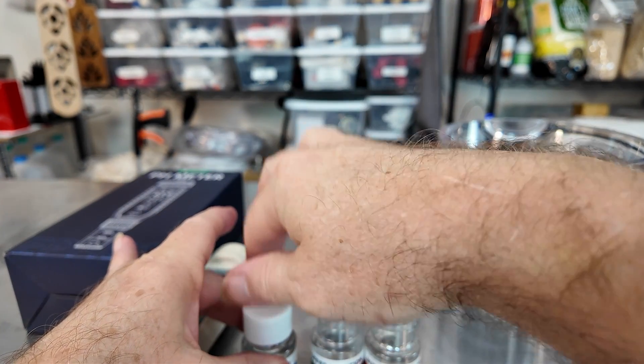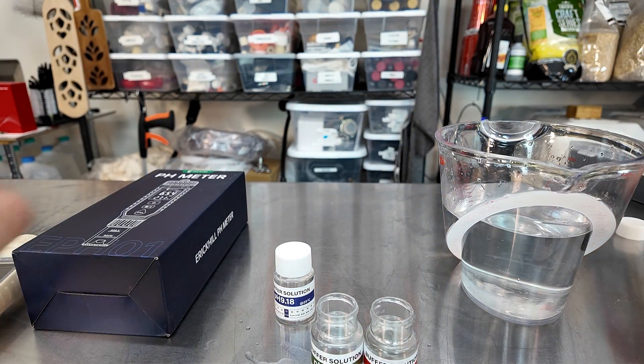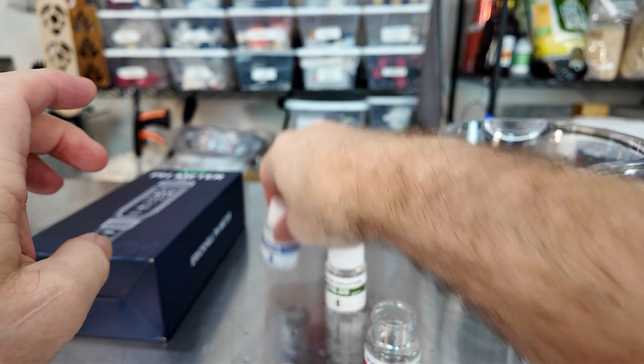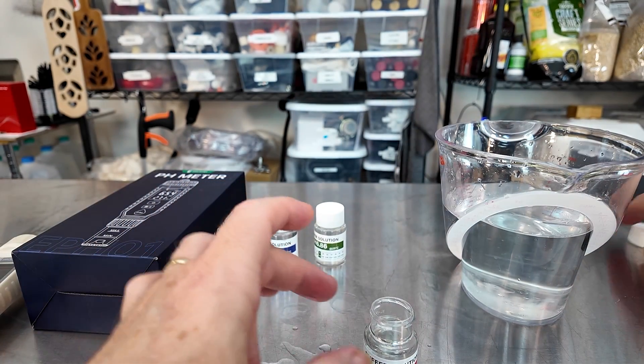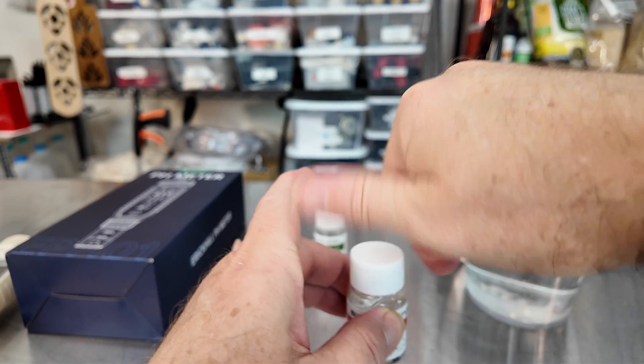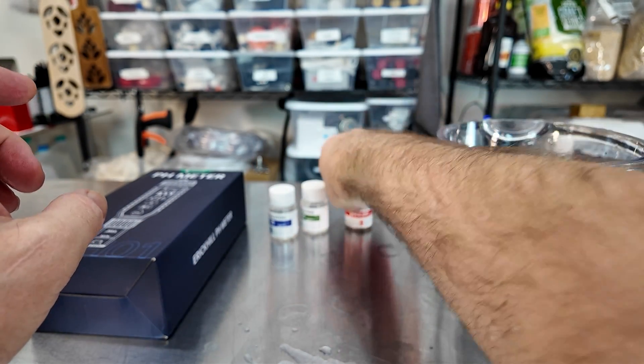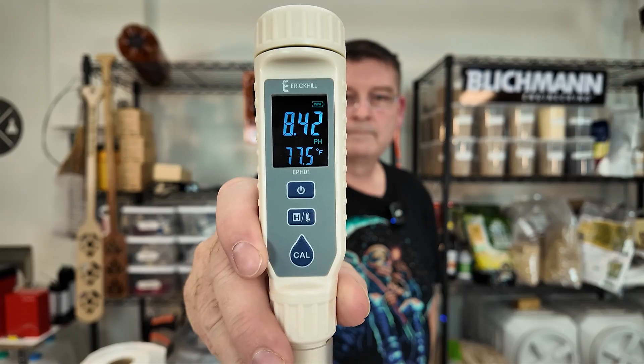Make sure you close these up — you're going to need them again. If they're wet, dry them off before you put them back in the storage container. Wash your hands since you have acids and bases on your hands. Your pH meter should be calibrated now. Hopefully that was really easy. The biggest thing was patience — just simply patience.